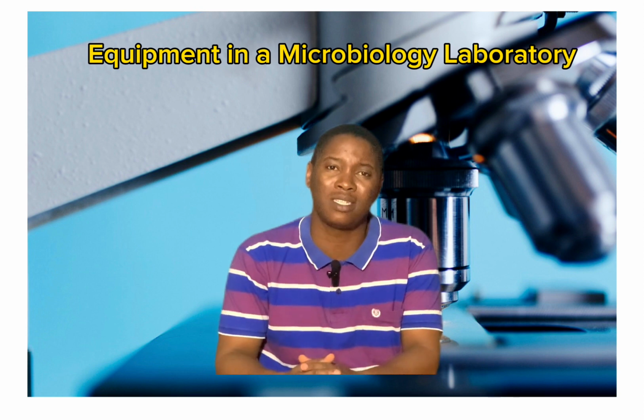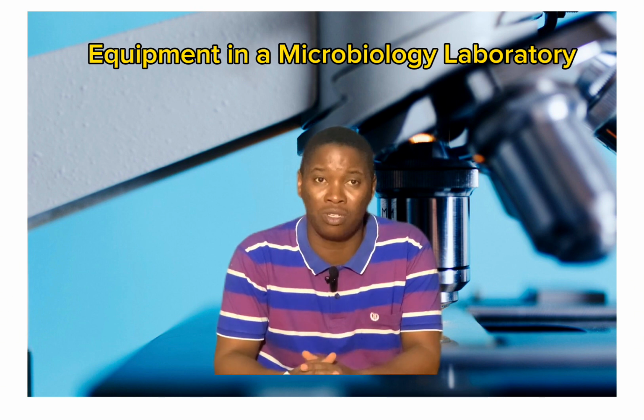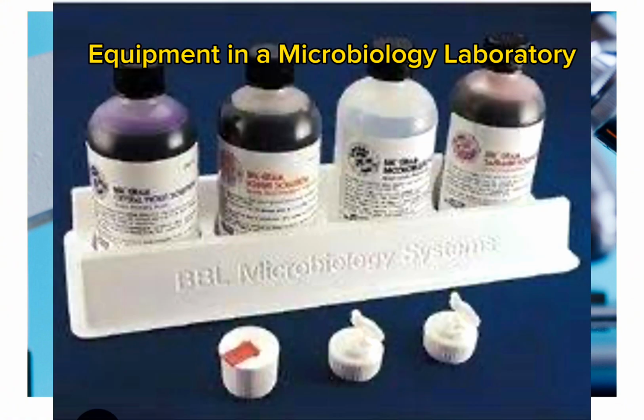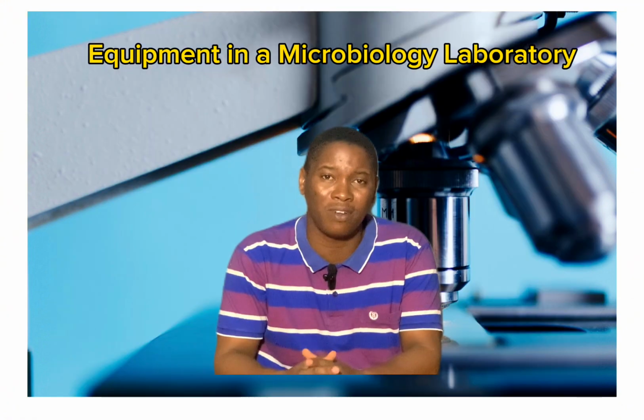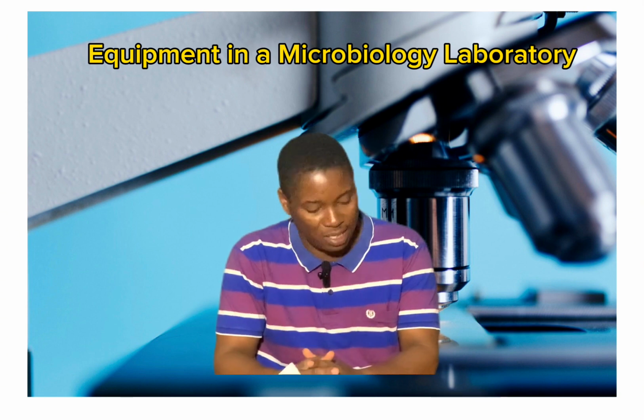There are different kinds of stains and dyes that are used in microbiology. You have the gram stain, which is the most popular stain that is used in microbiology. You have the acid fast stain, the capsule stains, the endospore stains, and many other different kinds of stains that are used to stain microorganisms. So, microscopes, stains and dyes.